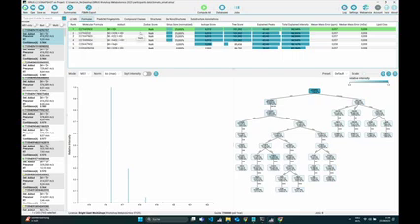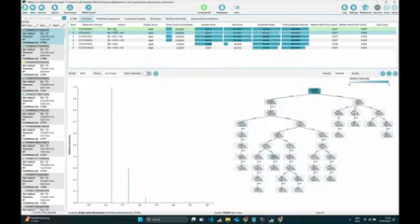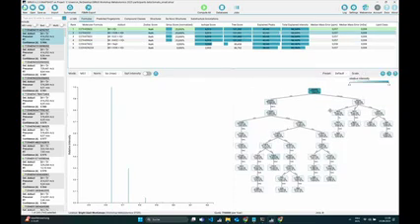And what you might see is that these first 4 hits actually share the same molecular formula. The only thing that is different is the detected adduct. So if you just add the adduct to the formula, we'll get the same formula. And you will also see, if you just scroll through this a little bit, that the fragmentation tree on the right will look quite similar. And all the scores that you have in the further columns will also be pretty much the same.